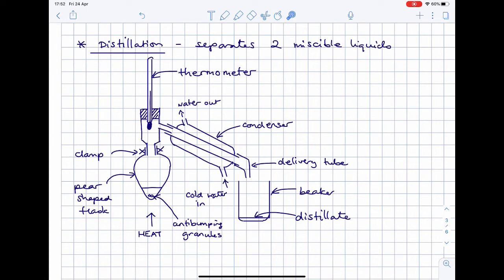So during the oxidation, we need to keep an eye on the temperature of the vapour that's coming off into the condenser to check that it is the aldehyde that is being collected. As we heat the mixture, the temperature will rise to the boiling point of the aldehyde, and at that point the vapour that's being collected will be the aldehyde, and the temperature shouldn't rise until all the aldehyde has vaporized away, meaning that all the alcohol has converted to the aldehyde.